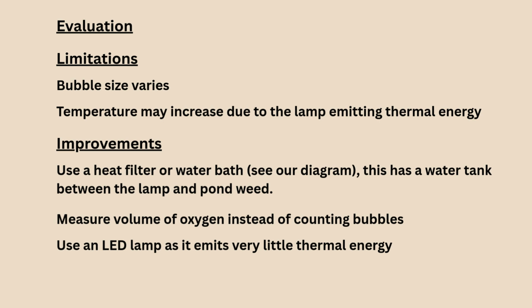See our diagram, where this has a water tank between the lamp and the pondweed to absorb the heat energy of the lamp. You could measure the volume of oxygen using a gas syringe instead of counting the bubbles, and use an LED lamp as it emits very little thermal energy.